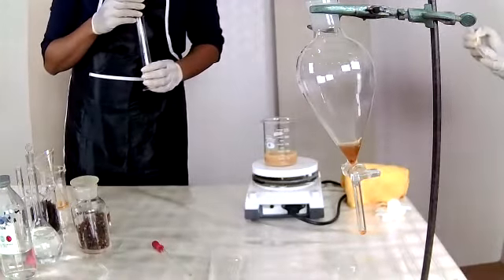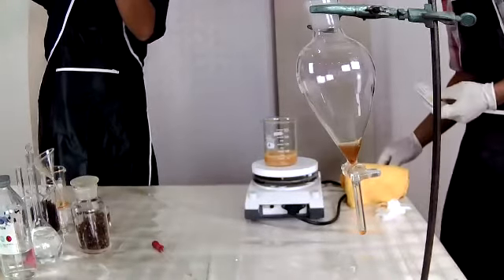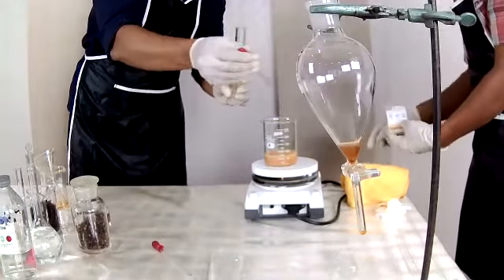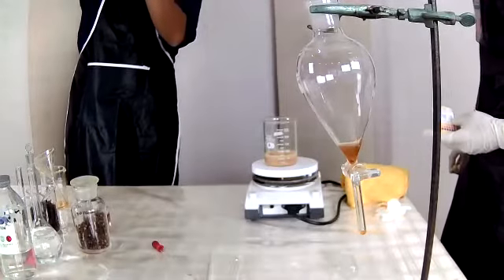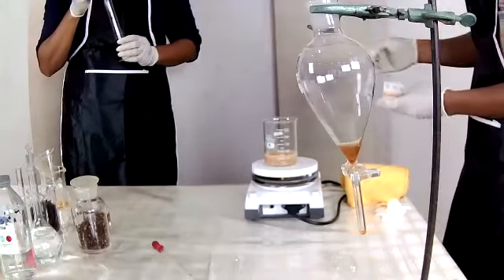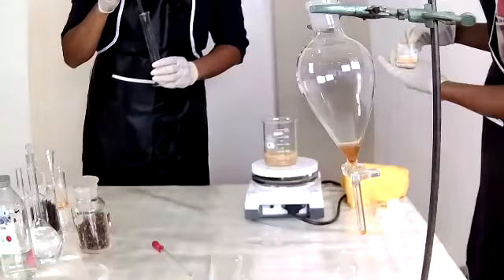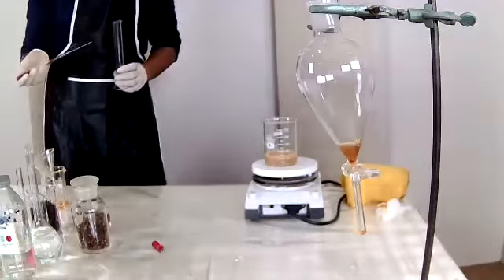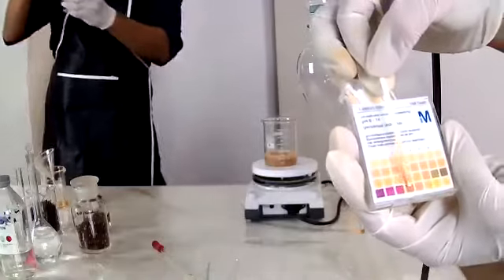It's going down to 8 pH level. And you can see this is 4.